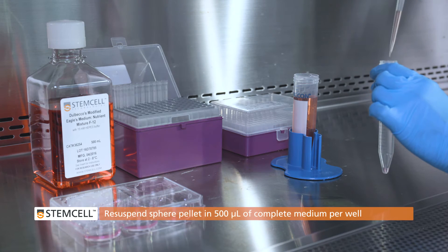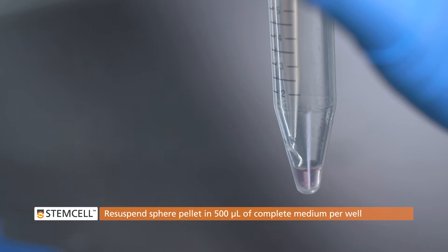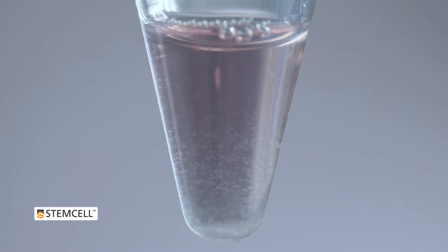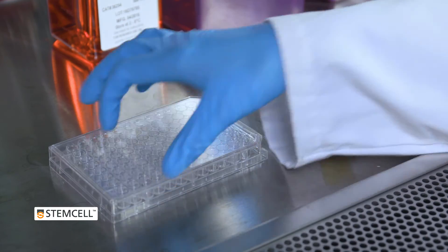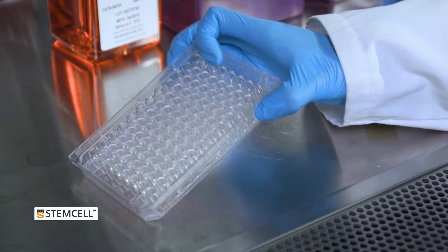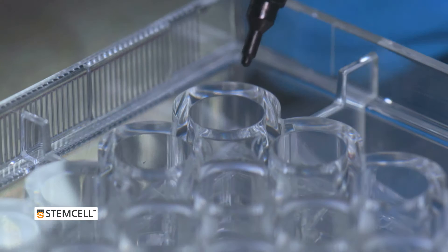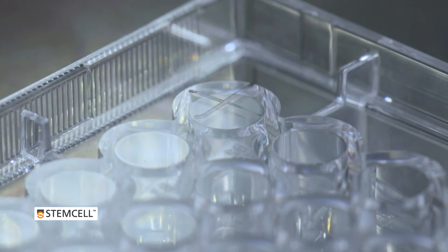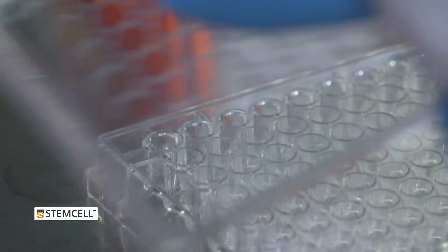Re-suspend the pellet to a final volume of 500 microliters of complete medium per well of a 6-well plate. Using a fine tip marker, divide one well of a 96-well plate into quadrants by drawing a plus sign on the underside of the well. The quadrants will help you keep track of which spheroids have been counted.